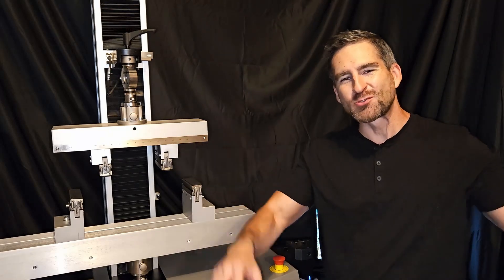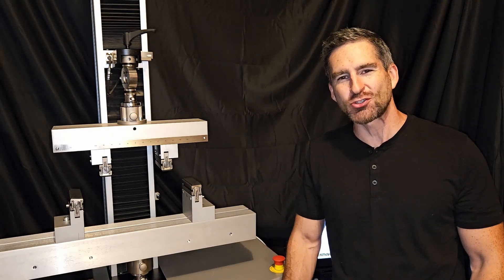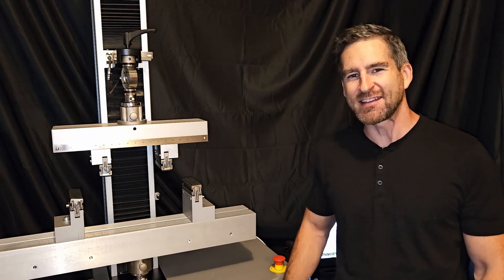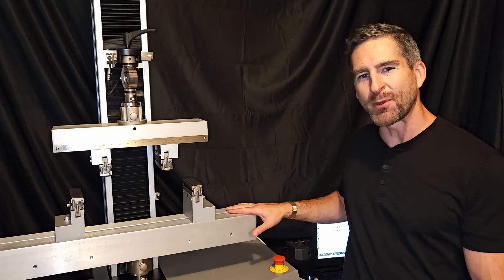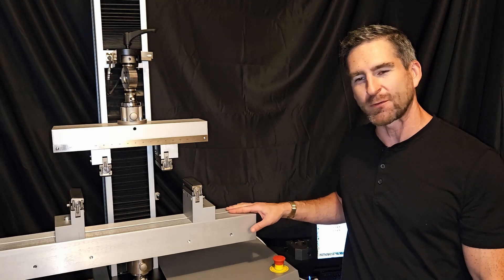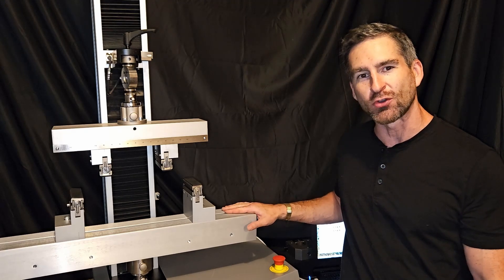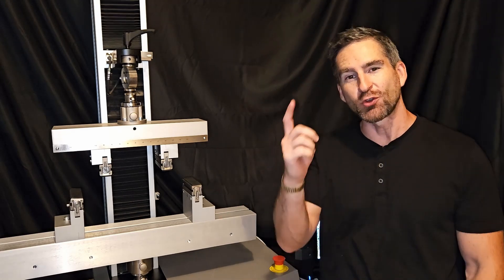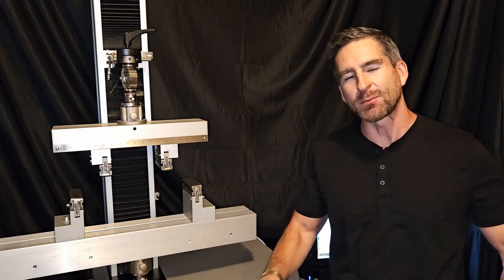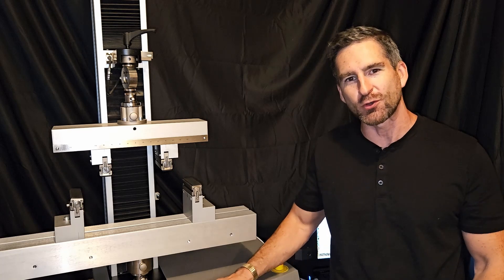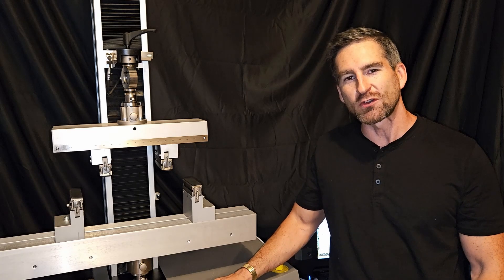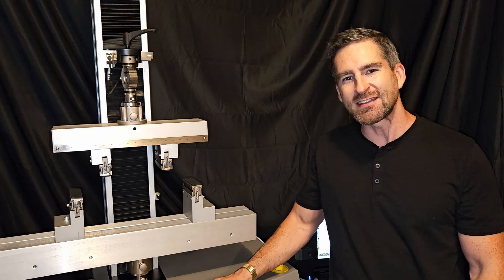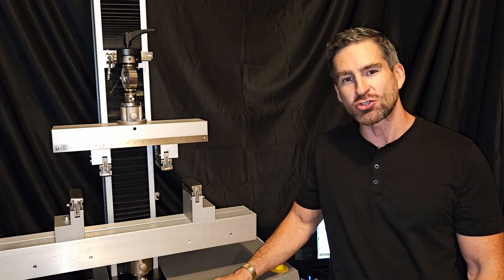Hello and welcome to Universal Grip. Today we are showing the ASTM C393 Bend Fixture for testing composite materials. If you're new here, my name is Frank and I'm the founder of Universal Grip.